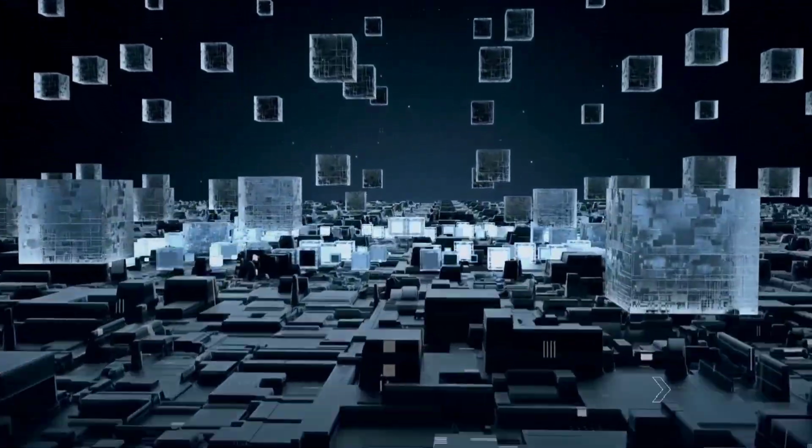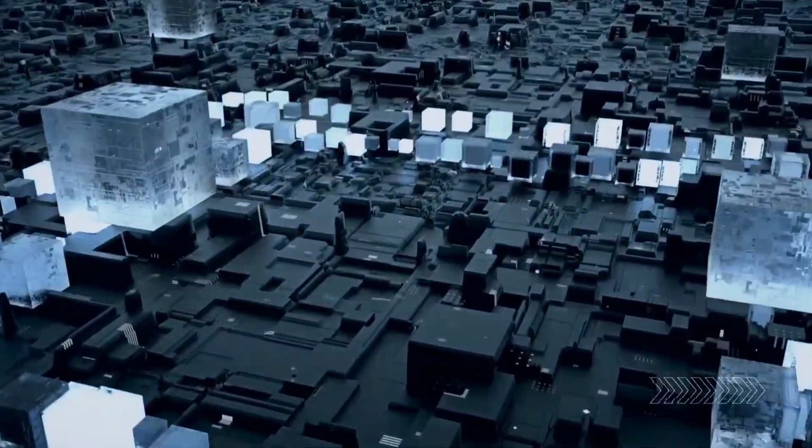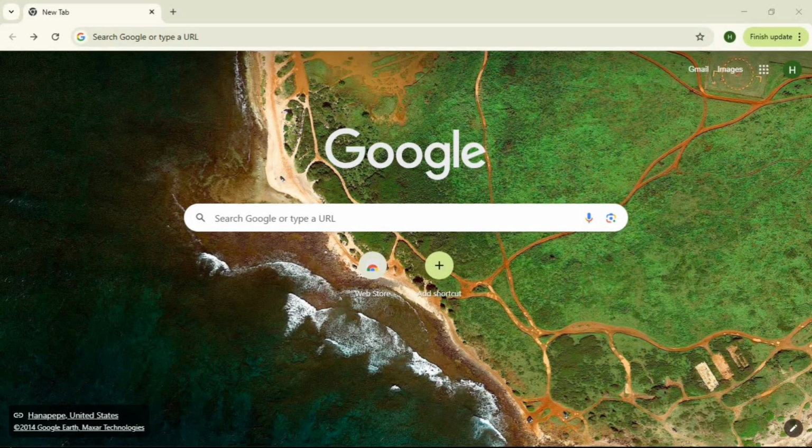Welcome to Photon Digital Platform, a system we've designed to make the process of requesting analyses and managing samples precise, professional, and completely error-free. Over the next few minutes, we will explore how to create an account on the platform, select the correct type of analysis, enter your sample specifications, and track your sample's progress until the results are ready. We'll go through every step together. So let's begin.